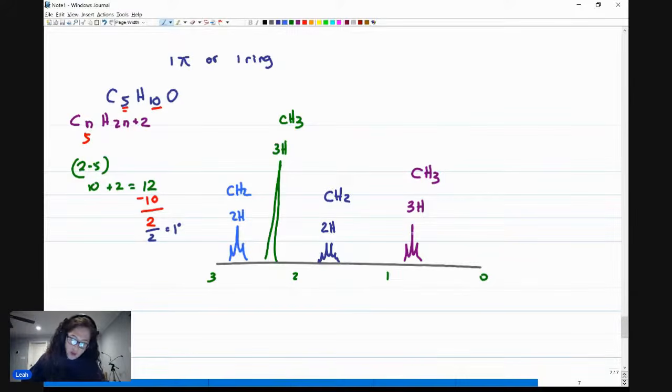If I count all this up, I have accounted for on this graph a total of 4 carbon atoms and 3, 6, 8, 10 hydrogen. That means all I'm missing from my original formula of C5H10O is a carbon and an oxygen.